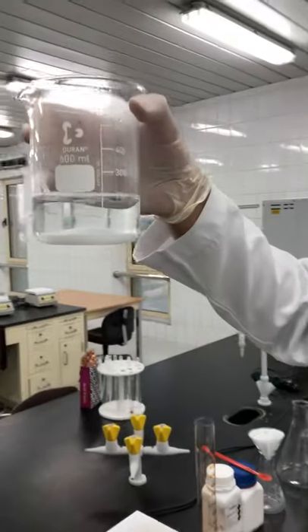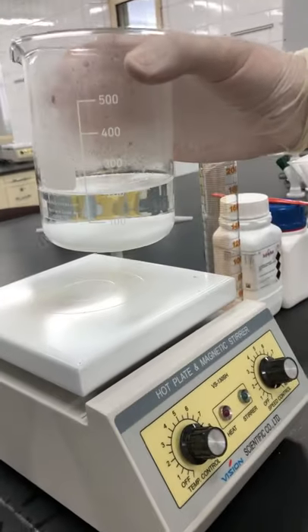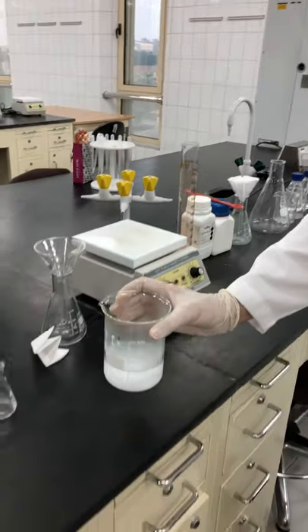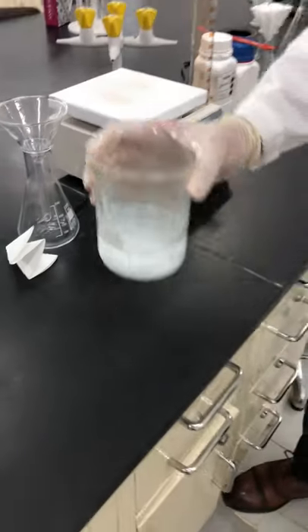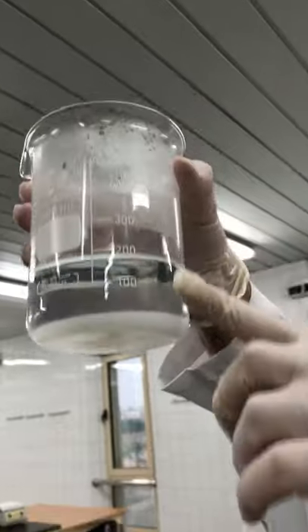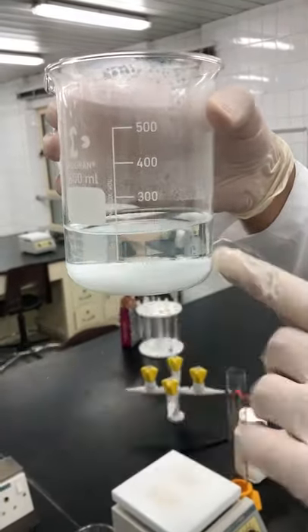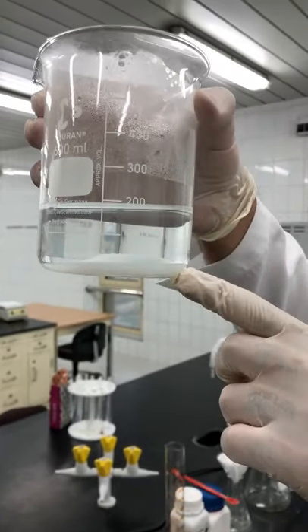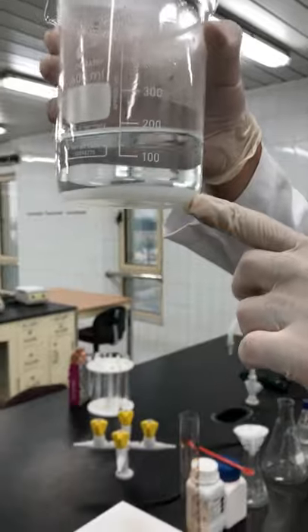Now, after 20 minutes, the reaction is complete. I took the reaction mixture from the hot plate and let it sit for five minutes to allow the two layers to separate perfectly. As you can see, this is the aqueous layer in which the excess reactant exists, and this is the solid layer representing the precipitate of barium phosphate.